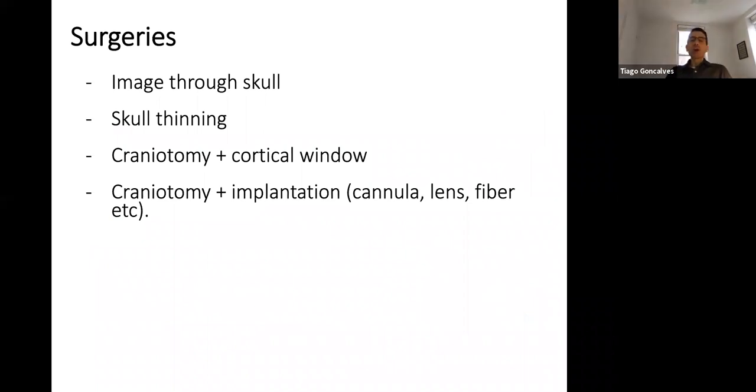So I'm going to move on to talk a little bit about the different preparations that you can use to image activity in vivo, activity or morphology in vivo. So we're not only talking about activity, I guess.